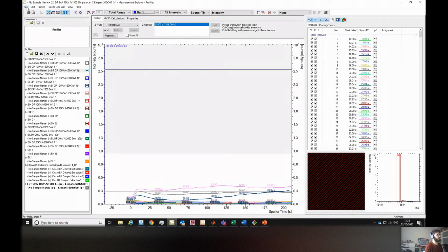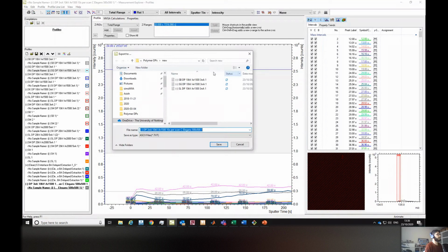So I go, as we just did for the other example, we go File, Export, and any name you want. And then you can just say, because now you need to give an extra name because they're all coming from the same data set, you can say like ROI1, for example, or any file. I could say head or tail or something like this.